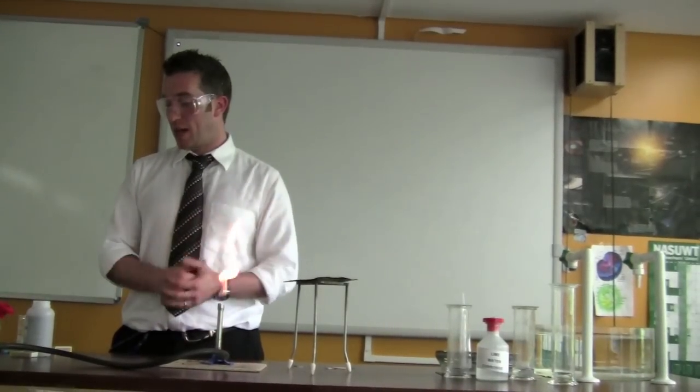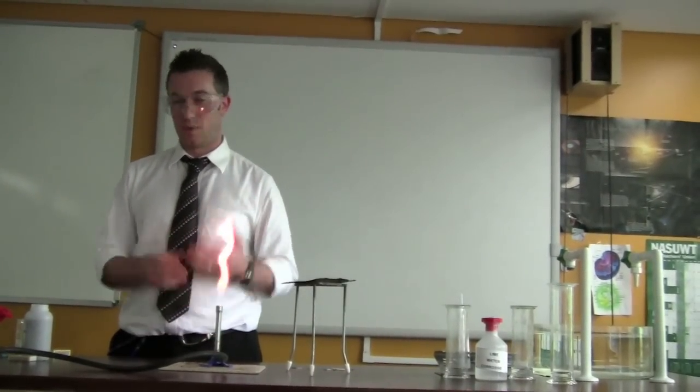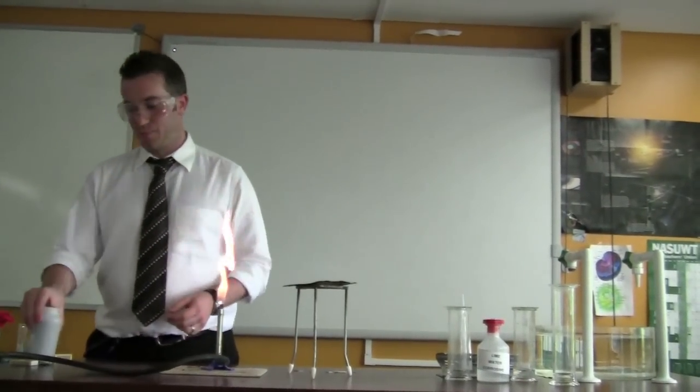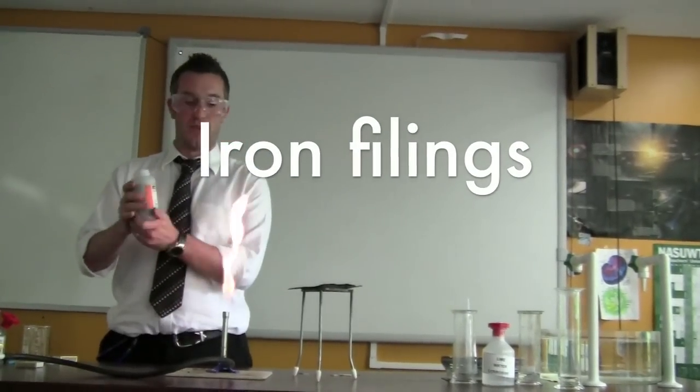Now we're going to test reacting metals with oxygen, which is in the air. Start with a bit of iron filings.